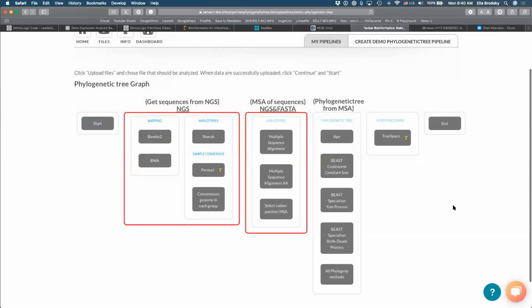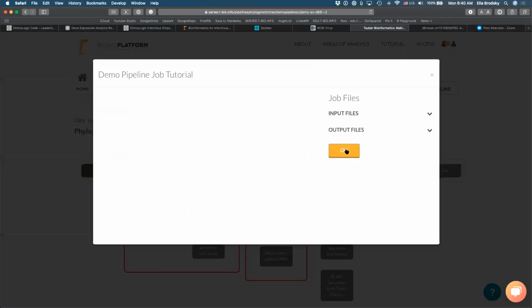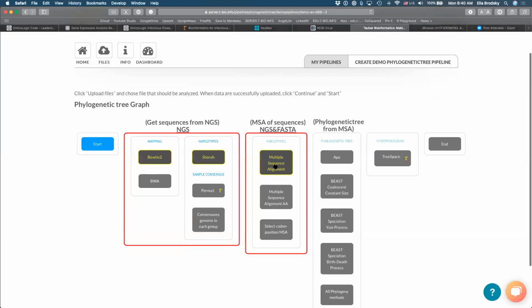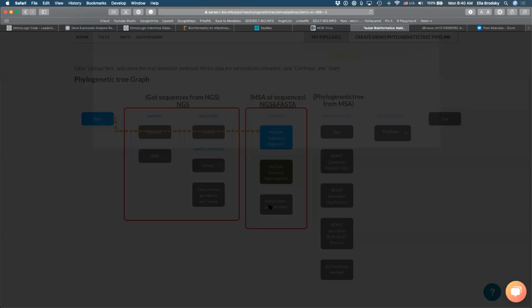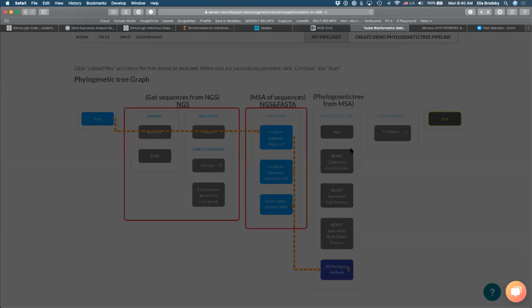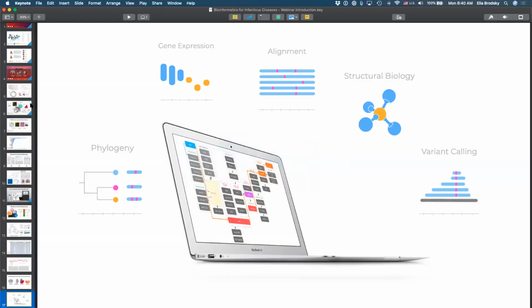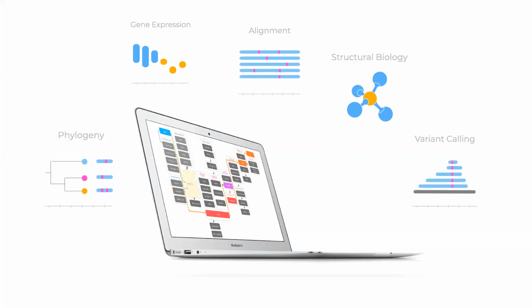let me go back here, where you can look at the specific relationships between viral sequences. So using multiple sequence alignment and then converting those sequences to amino acids, and then understanding variability using all kinds of phylogenetic methods that I'll talk about in a second, to really understand variability between genomic sequences. So let's take a look at the meaning of some of these basic analysis methods and how they could be used to study the genomic variation.